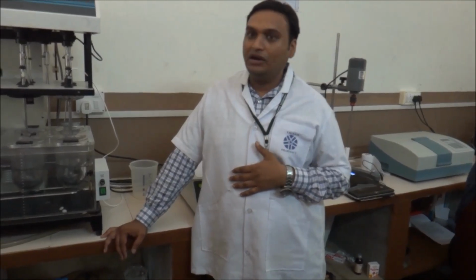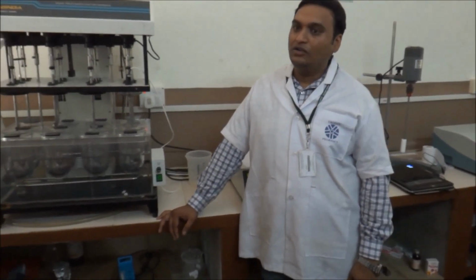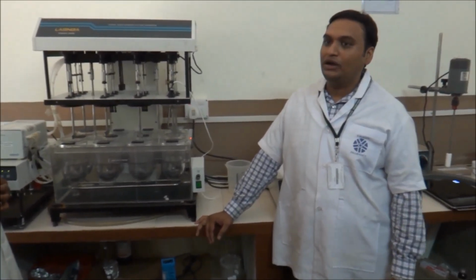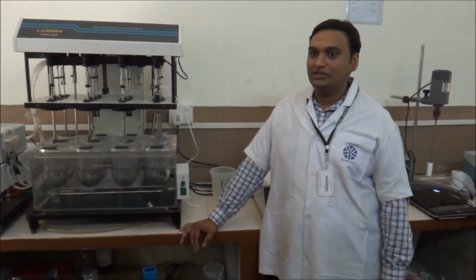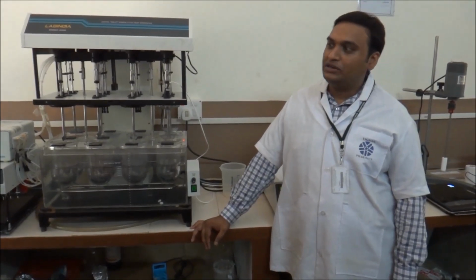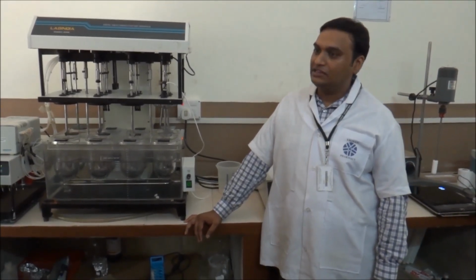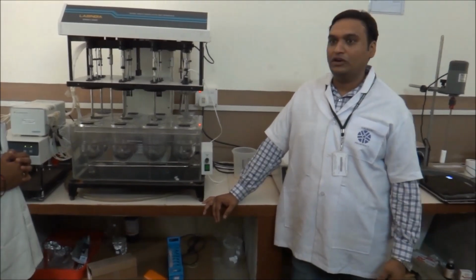So USP considers dissolution a very important process for establishing the quality of tablet or capsule dosage forms. As we all know, USP, the United States Pharmacopoeia, or the Indian Pharmacopoeia, any pharmacopoeia has regulatory requirements, and being a very good quality control parameter, the instruments that are employed for assessing this quality are also regulated by USP or IP.